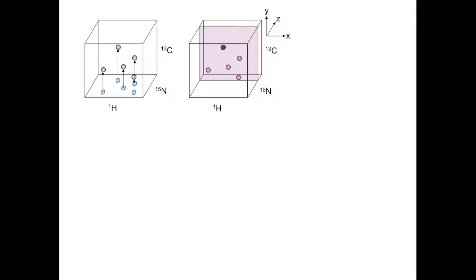But you can also imagine looking at planes another way. This time you'd have protons along the x-axis again, but nitrogen along the y-axis and carbon along the z-axis. Your planes would be taken at different carbon positions.